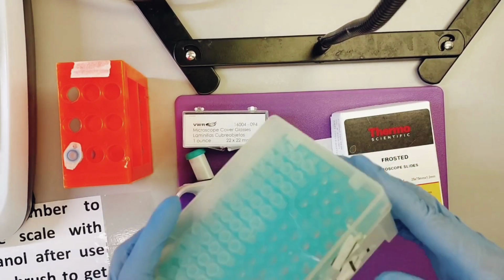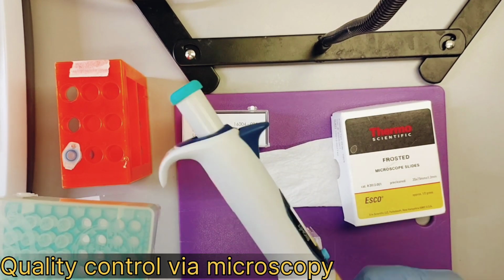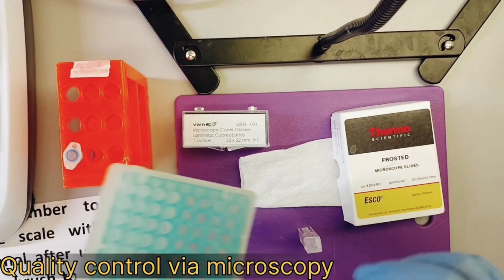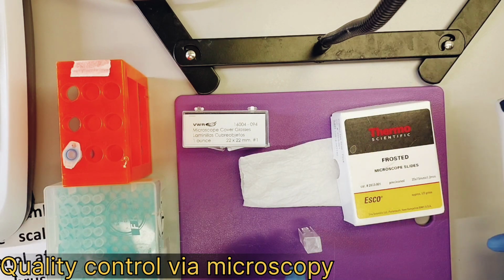I'm going to set up the sample so that I can do the QC on it, so that is looking at the relative abundance and the shape and size of the spores or cells under the microscope. Then once that's done, I'm finished with that part of it. So these tips fit the 2 to 200 microliter pipette, and they're non-sterile because I'm just doing it outside, so this doesn't have to be sterilized.